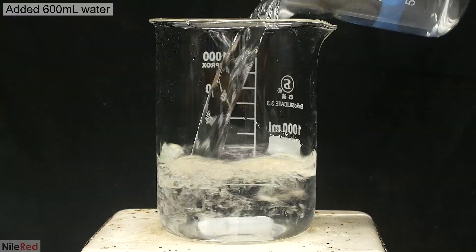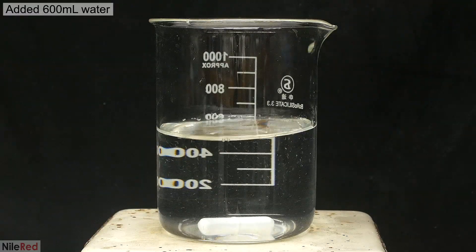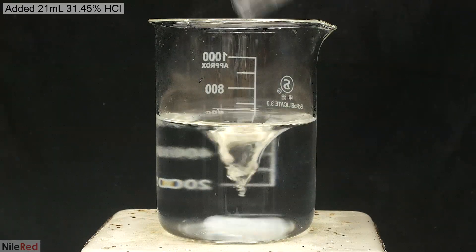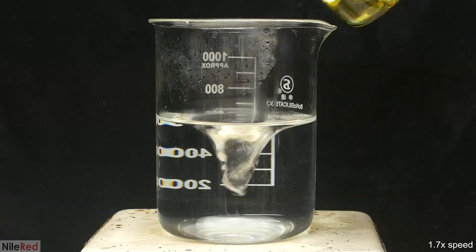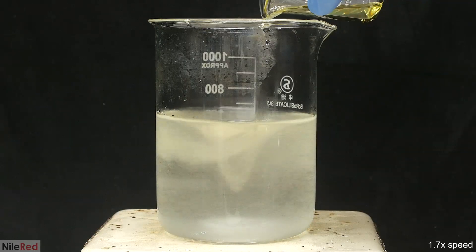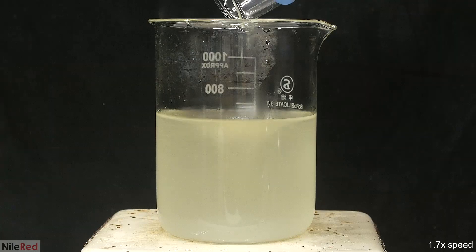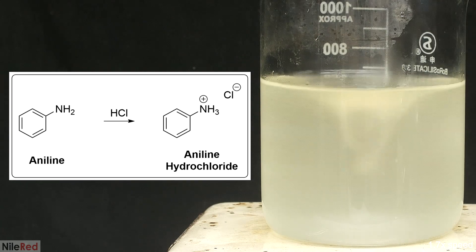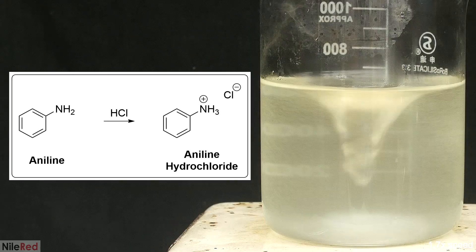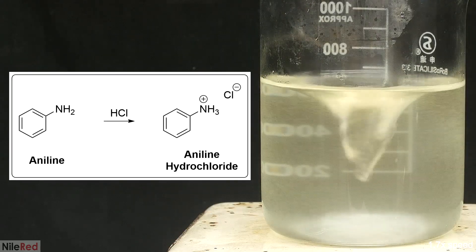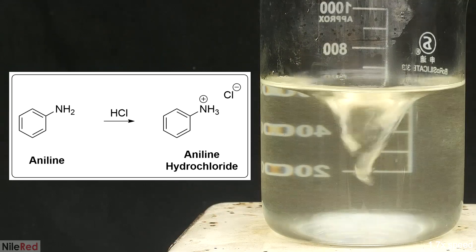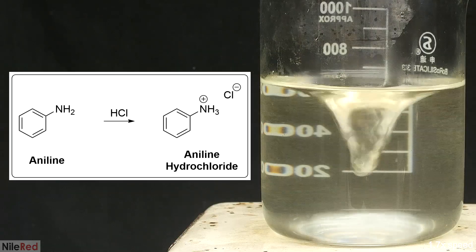Then, into another beaker, I add some distilled water. I turn on the stirring, and I slowly pour in some hydrochloric acid. Once all of the acid is added, I can start to pour in the aniline. Under normal conditions, aniline is insoluble in water. In this case though, the water is acidic, and aniline is a base, so it's going to undergo an acid-base reaction. This leads to the formation of aniline hydrochloride, which is a salt, and soluble in water. So I just continue stirring, and wait for all of the aniline to react.